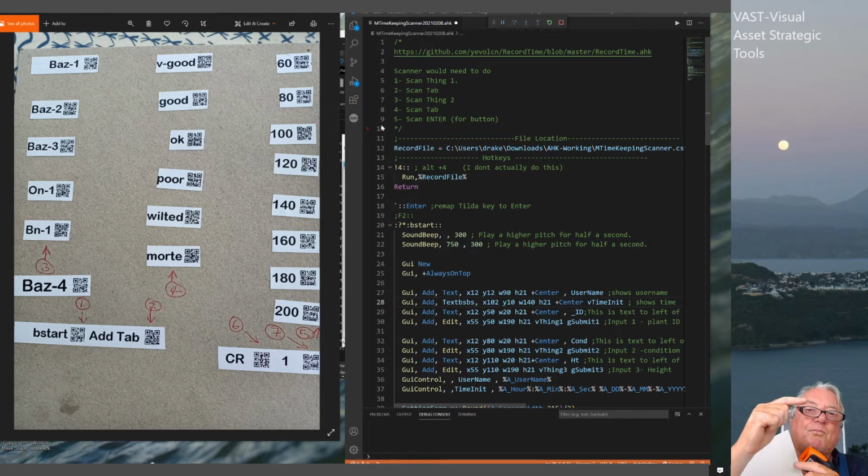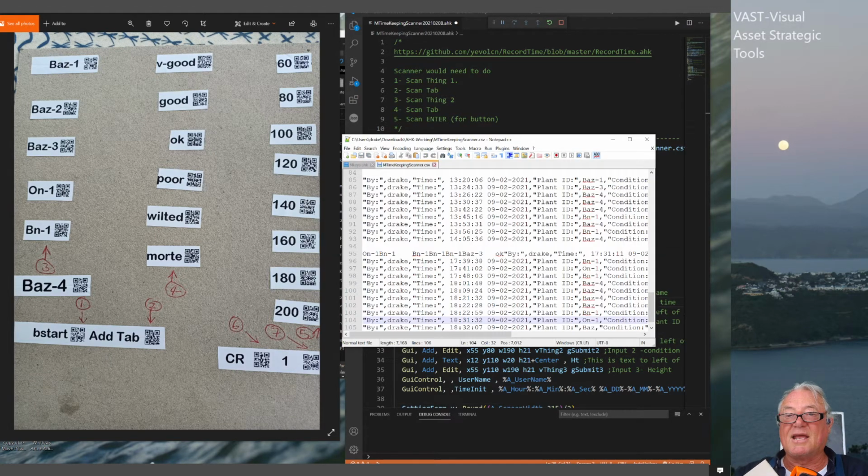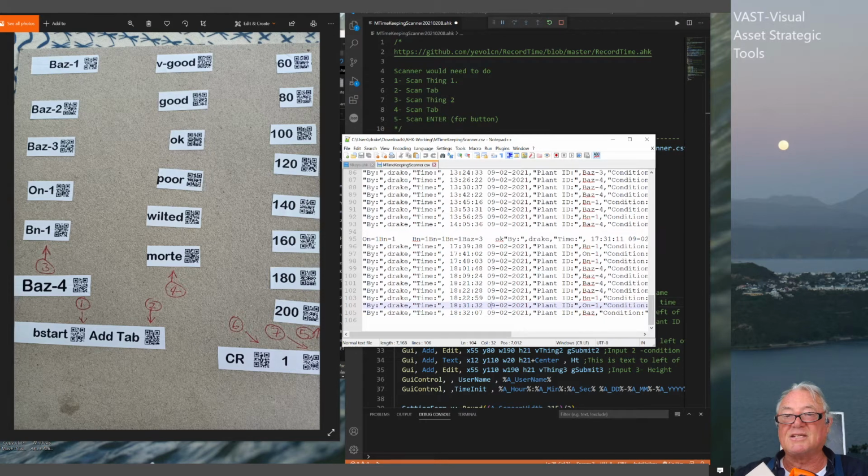So by actually doing this as an actual test itself, you suddenly realize that you're not looking at the computer. You suddenly realize that there's all these other things. So how can I make those things happen? So I've simplified the data by only using the one program, the AutoHotKeys, and using the GUI to grab the information that I want. And then if I just go into my extra file, it's saying update, and then there's all these extra fields of updates that I've done through there.